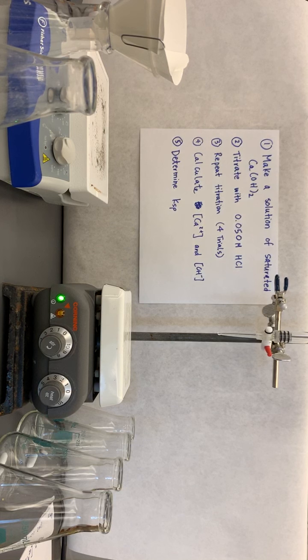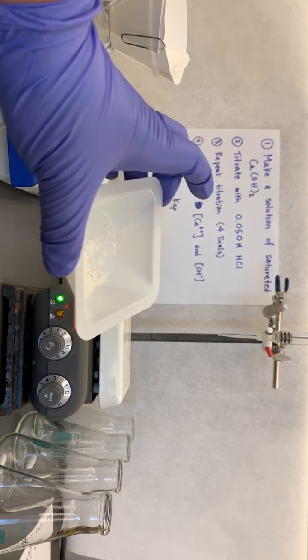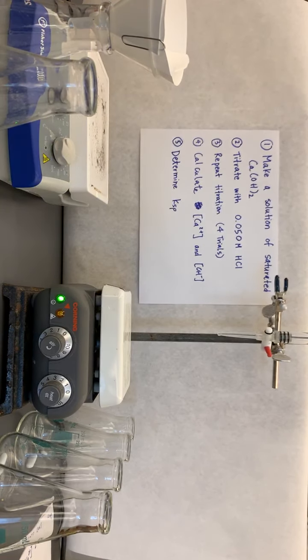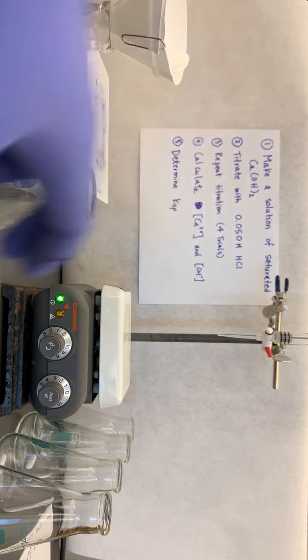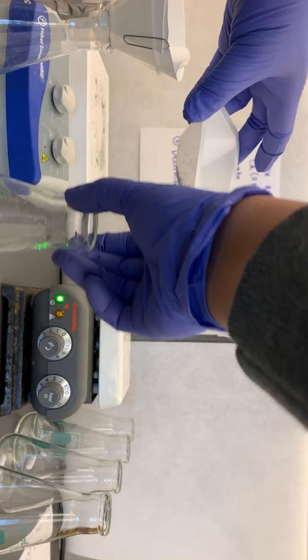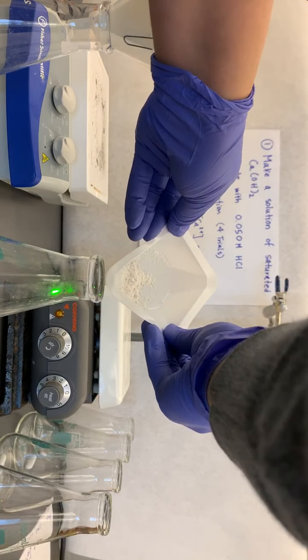All right, so the first thing we're going to do is make a solution of calcium hydroxide. I have weighed out here our 0.4 grams of calcium hydroxide. I have also got here 60 mL of DI water with my stir bar inside there. So I'm going to go ahead and add this calcium hydroxide to my water.